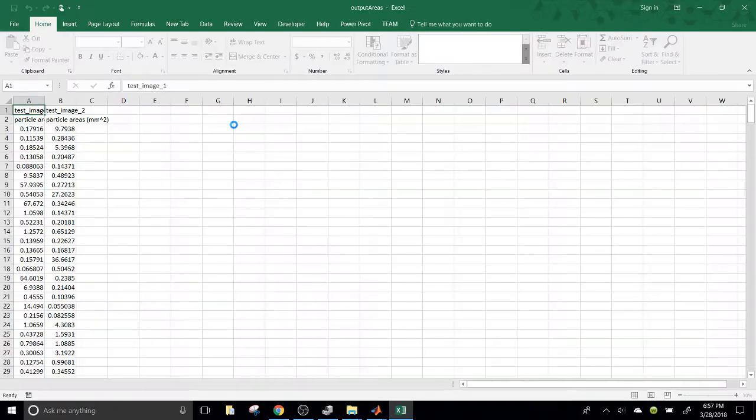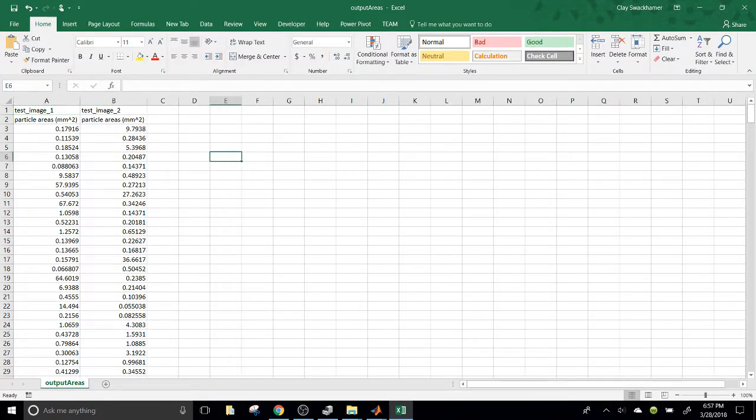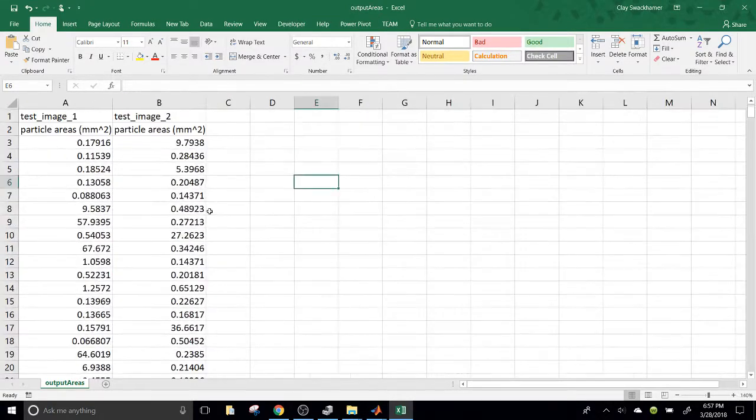Now this, you notice, is a funny Excel icon. It's because it's actually a CSV or comma separated value workbook, which is kind of a nice archival data format. It's good for sharing with people that might be on a different version of Excel. A downside is that you can't do a lot of the fancy Excel formatting, but you can open it in Excel and such. I think it's a good platform for this use.